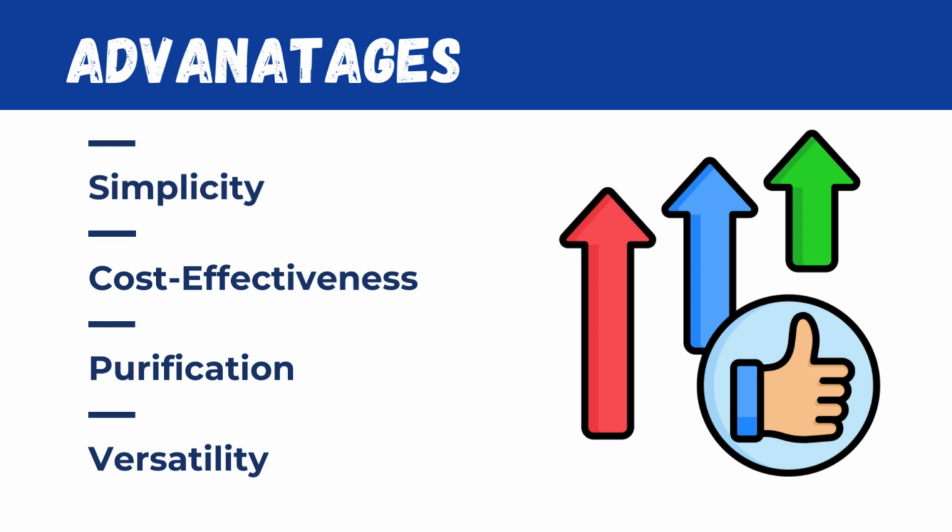Okay? The second advantage is cost effectiveness. Simple distillation is often more affordable compared to more complex separation methods. It does not require sophisticated equipment, making it accessible for various applications. The third advantage is purification. It's effective for separation of liquids with a significant difference in boiling point, allowing for the purification of substances.